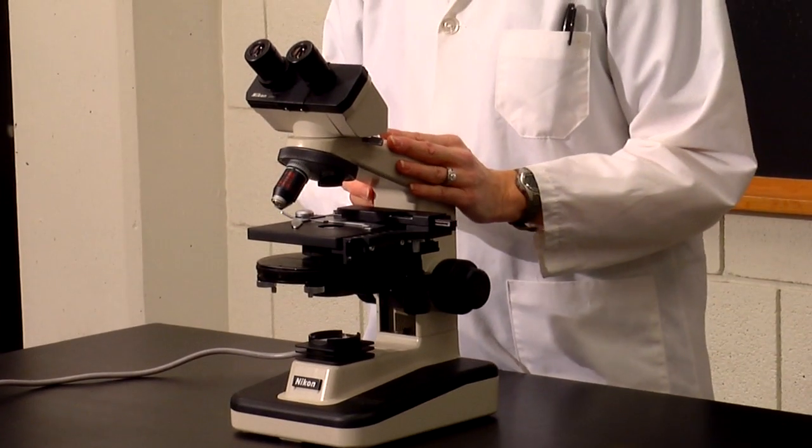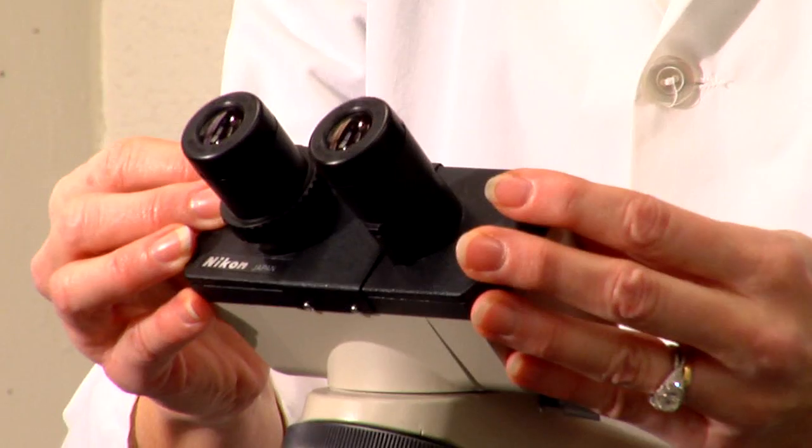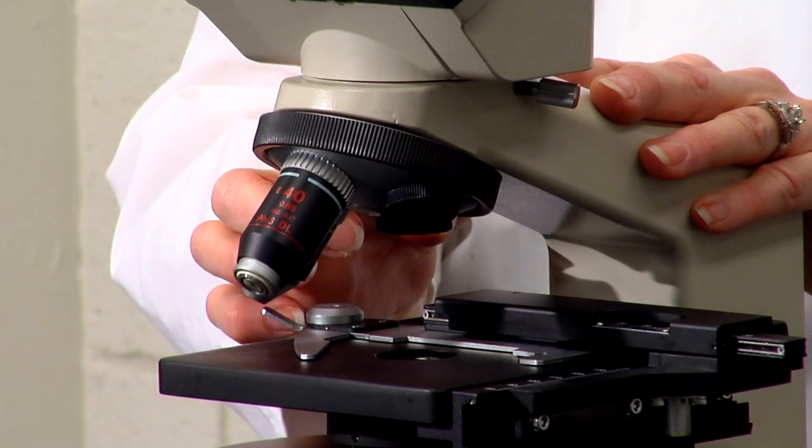This is called a compound microscope because it has two magnifying lens systems in series. This is unlike the dissecting microscopes we have used, which have a single magnifying lens. The compound microscope has a lens close to the eye, the ocular lens, and it has a lens close to the object being viewed, or the objective lens.